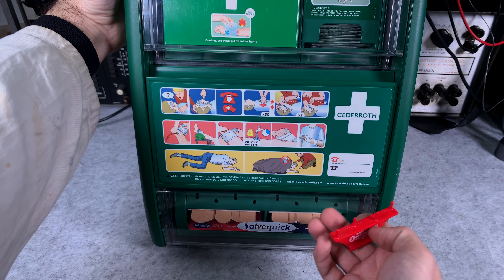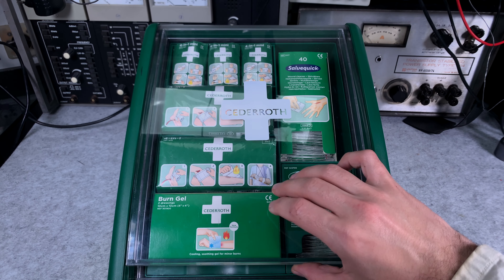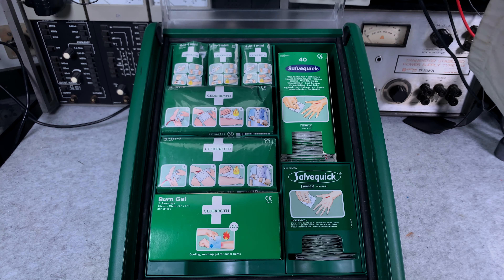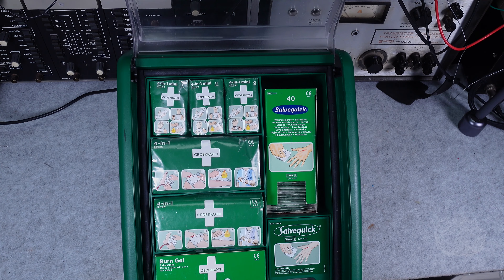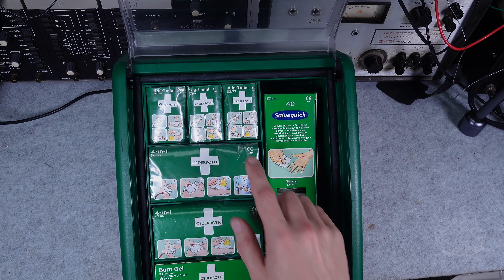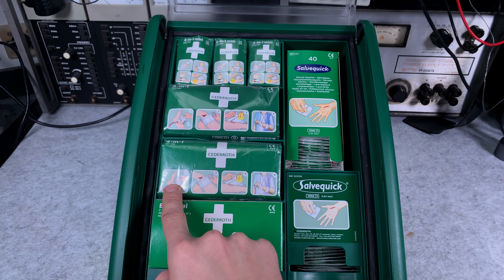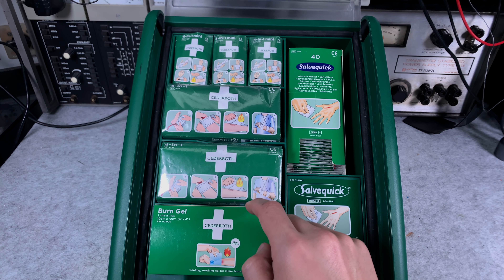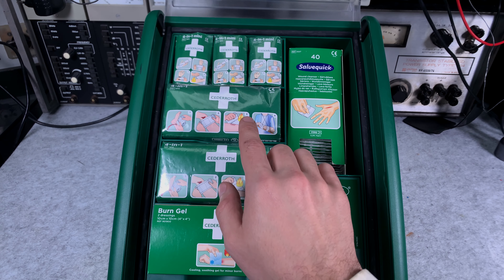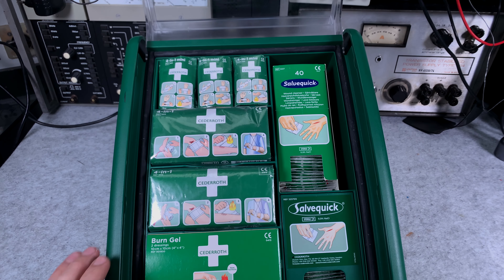There's a key for replacing things like the band-aids — you press it like this and then you can remove it; this is also to prevent stealing. The biggest compartment is completely transparent so you know exactly what you are looking for. Even if you've never paid attention, if you take a look at the pictogram you know this one is for burn — you can clearly see a fire icon. Here you can see it's going to be for a leg or arm, and here you can see the four-in-one gauze.